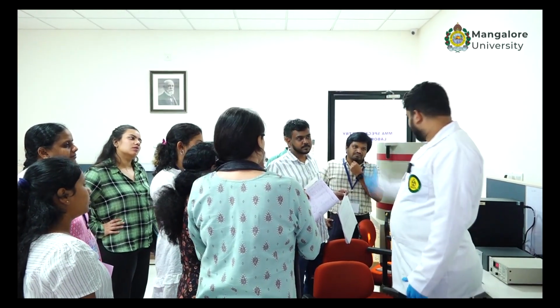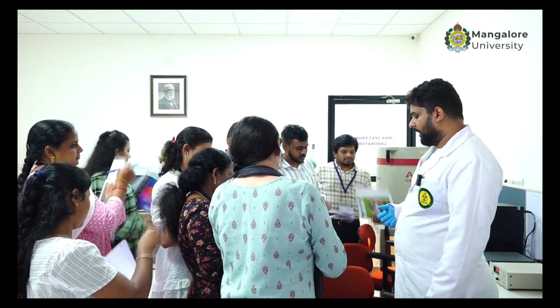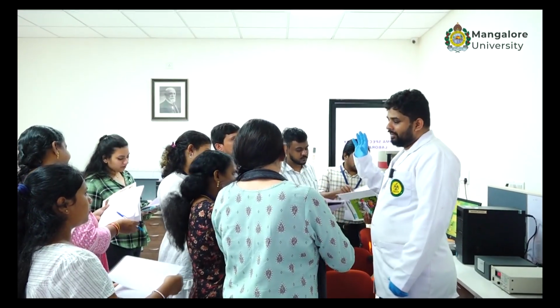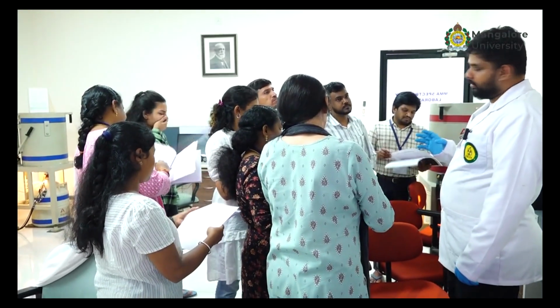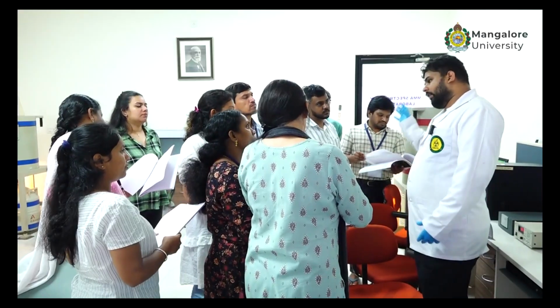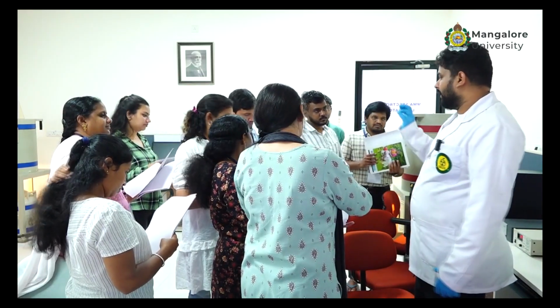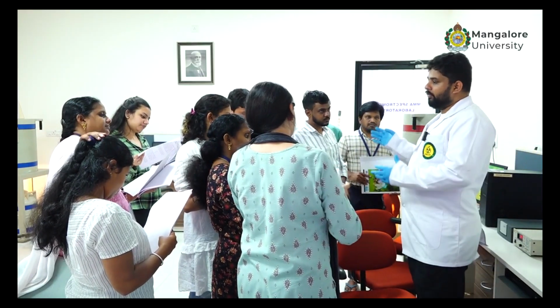Okay, the data sheet that has been given to you right now contains some radionuclides. Those radionuclides might or might not be present in the sample. First I'll give you a QC water sample. In that you identify the radionuclides and write them down in this table, and after identification write down the abundance, all those data, and write down the counts and calculate the efficiency.